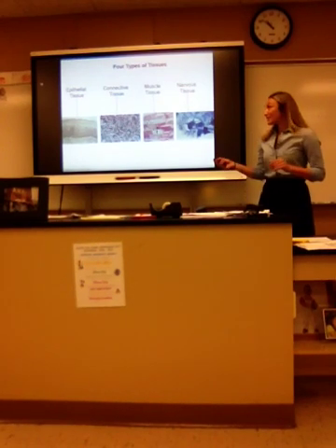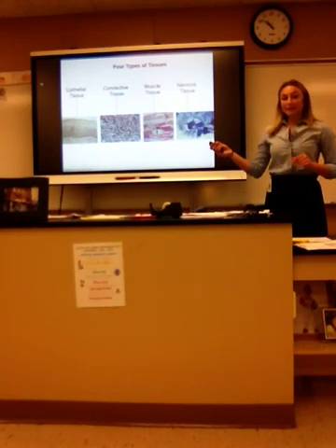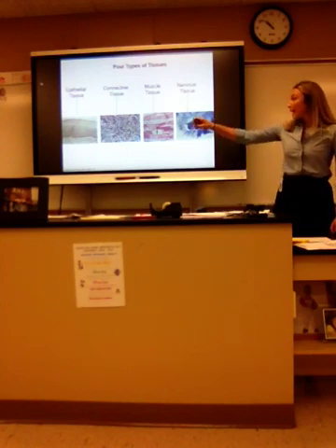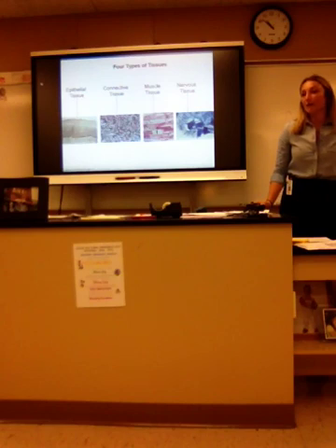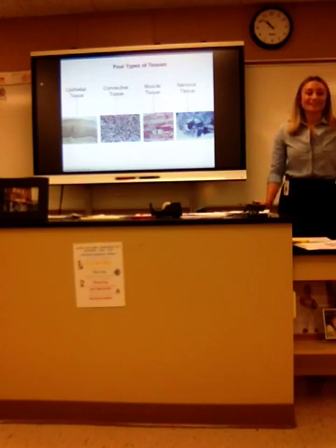Okay, so we're still working on tissues. We've done epithelial tissue. So can anyone tell me, raise your hand, what kind of epithelial tissue that is? I know it's small. Can anyone in the front couple rows? Gavin, do you got it? Give it a try. Simple squamous.